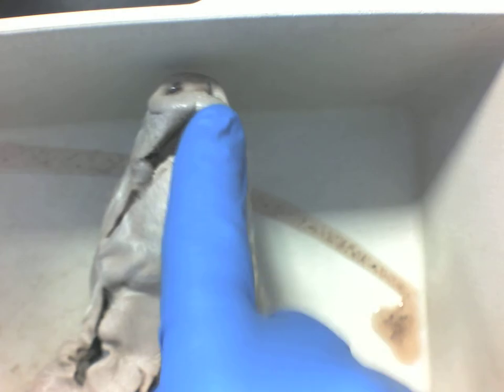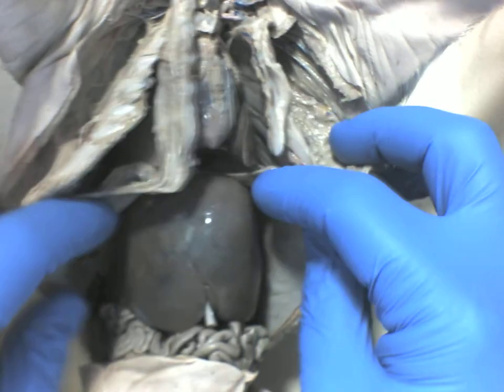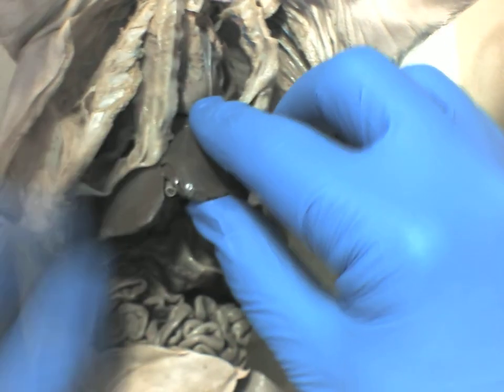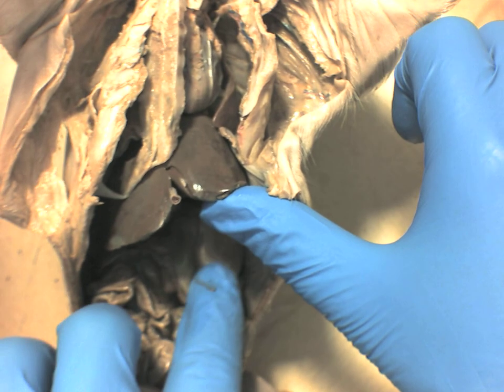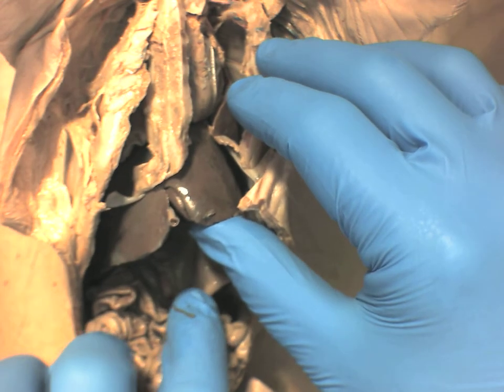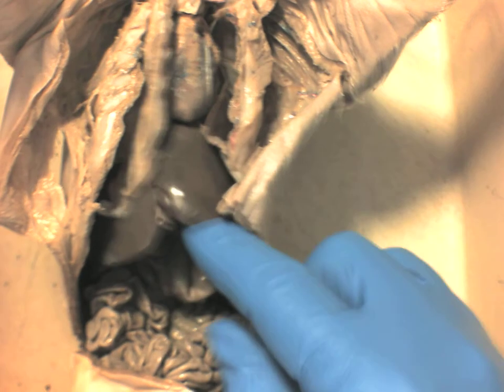After the food has been chewed up and we swallow it, the food will pass from the mouth, all the way down to this large structure right here. Underneath of this is the stomach. This right here is the stomach of the pig. From here to here, that's how long the food tube is going to be for the organism. What is the name of the food tube? The esophagus, very good. So the esophagus is rather long.